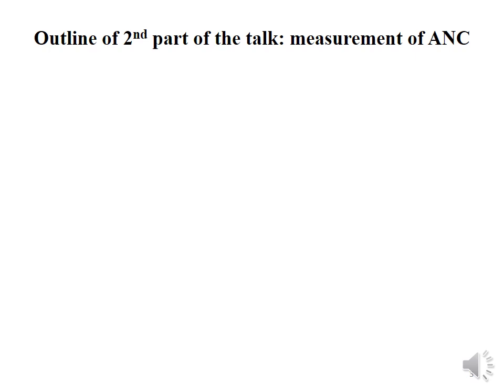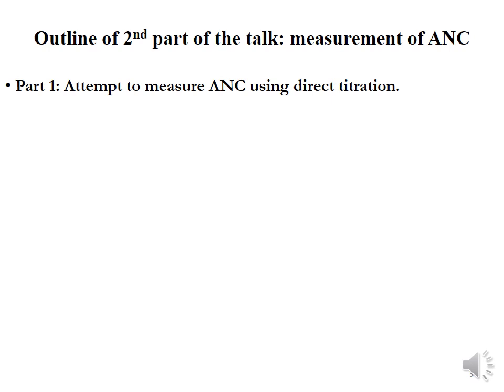We are a quantitative lab, so we need to quantify, and therefore to measure, the value of acid neutralizing capacity. The first part of the lecture will be about whether it's possible to measure the acid neutralizing capacity using a direct titration. We will try to do it. We will see if it's possible or not.